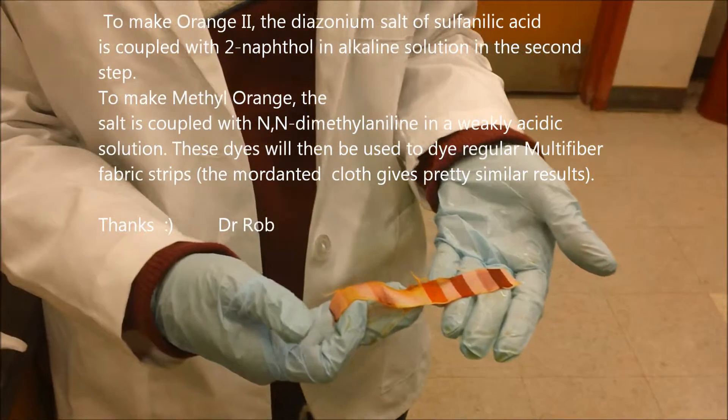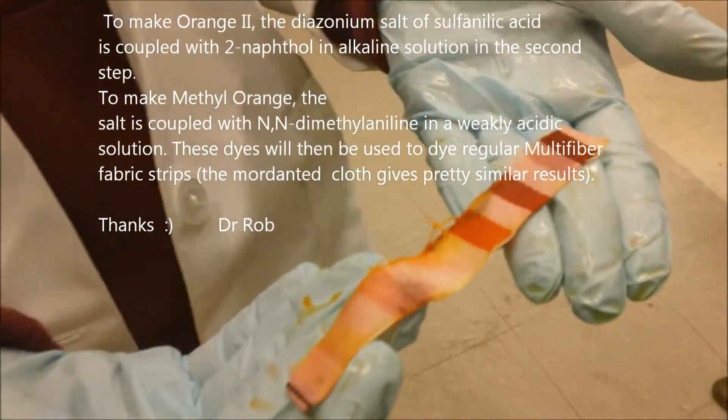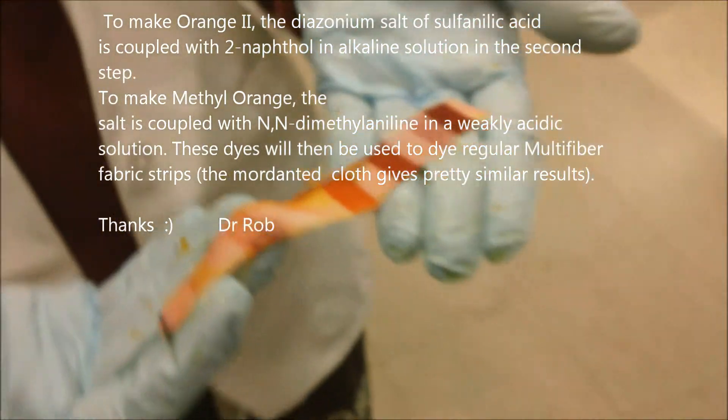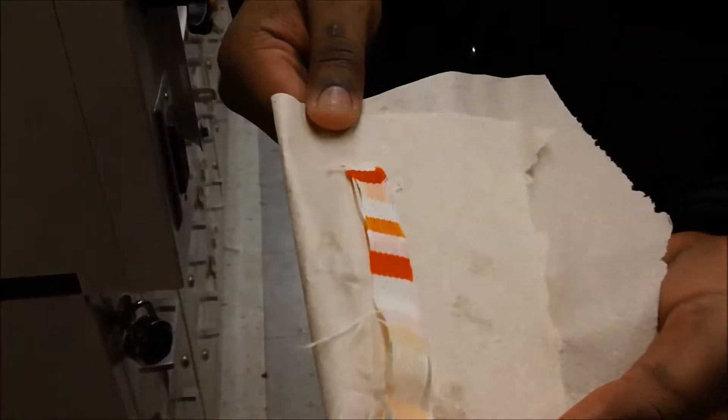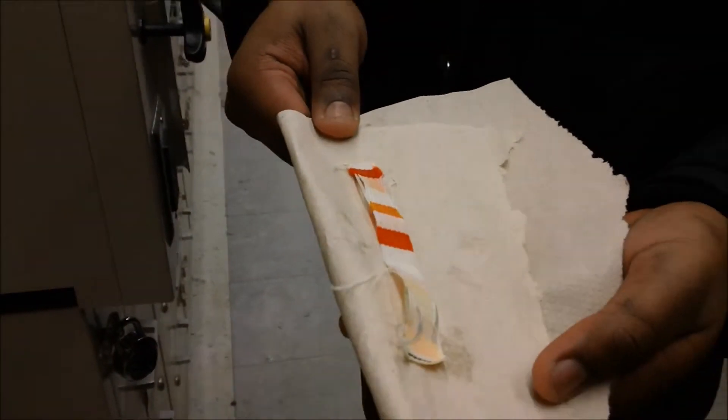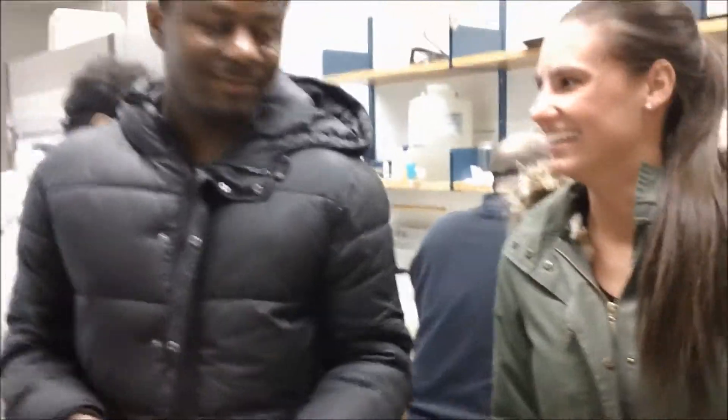That's good — each reaction, each different color, different dyes. Good job.